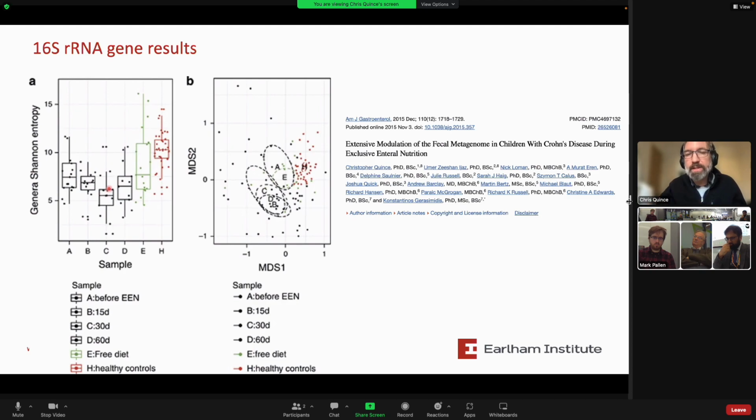Instead, what we concluded from this study, and the NMDS plot here shows the same thing. So we'll talk all about the statistics of the microbiome on Friday, but an NMDS plot, and this is probably something you've definitely not covered up till now, right? So this is a means of ordination.